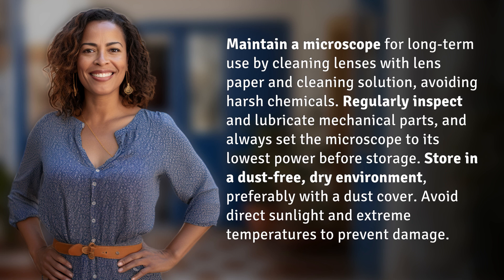Store in a dust-free, dry environment, preferably with a dust cover. Avoid direct sunlight and extreme temperatures to prevent damage.